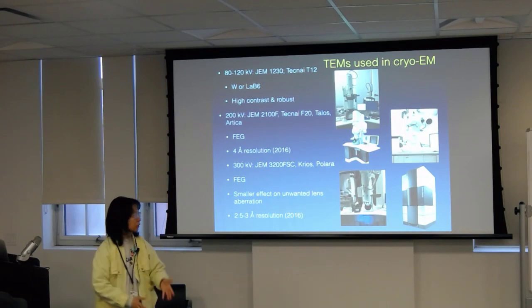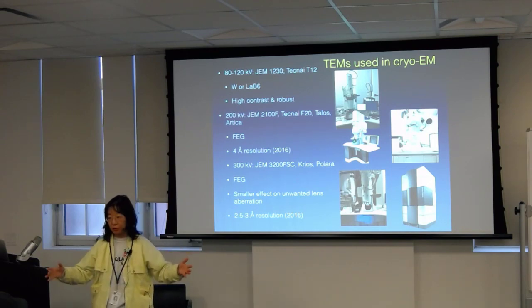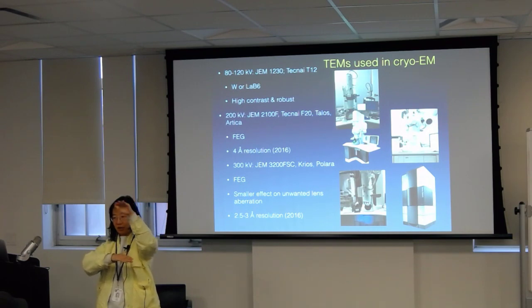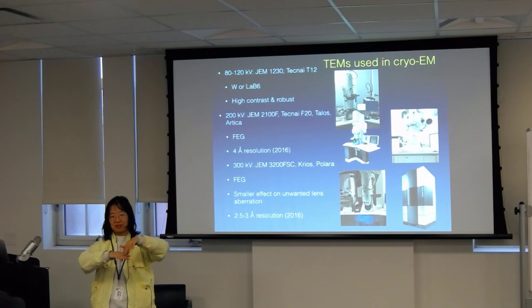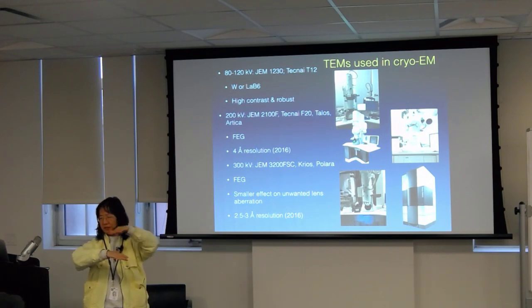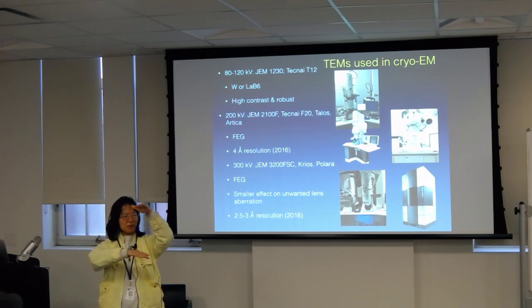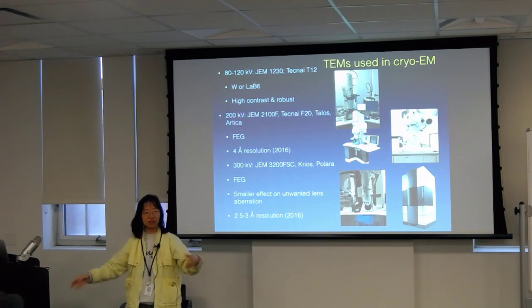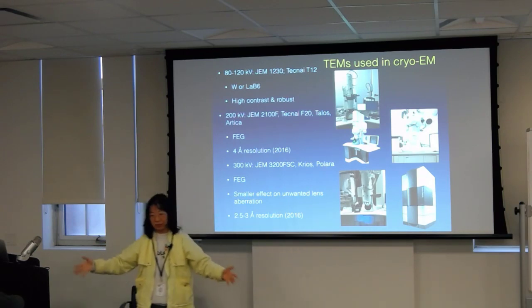So your room is going to need to be bigger because you need the, what's that called? Clearance, higher clearance. The stack. The accelerator stack. Yeah, the accelerator stack. You're going to need more. So it's bigger.